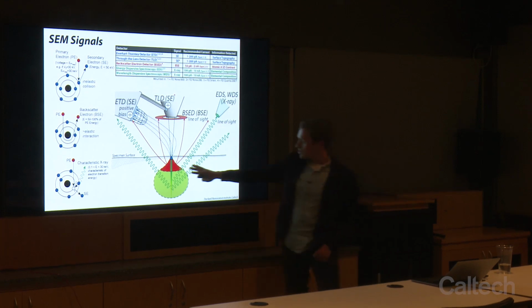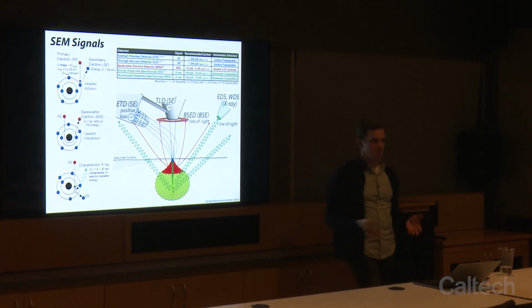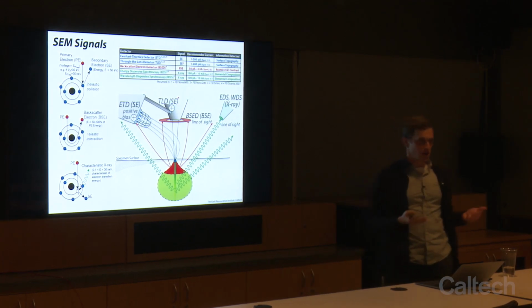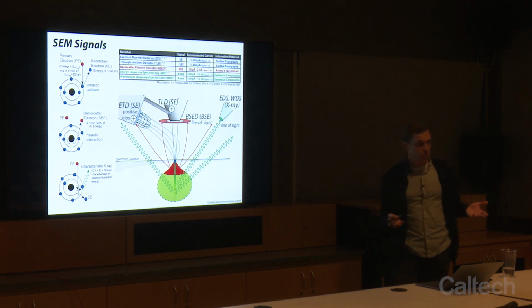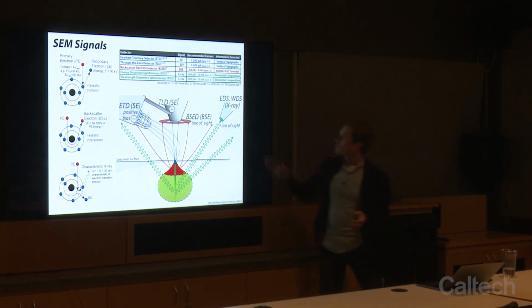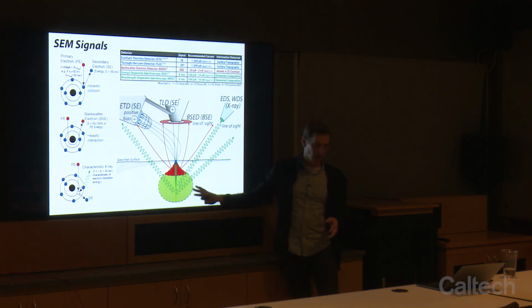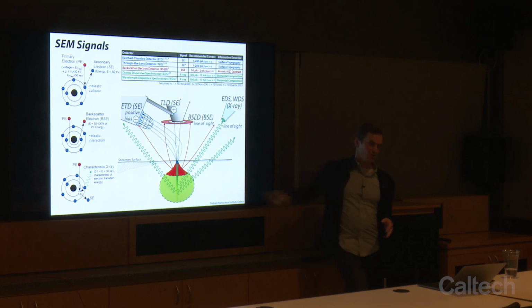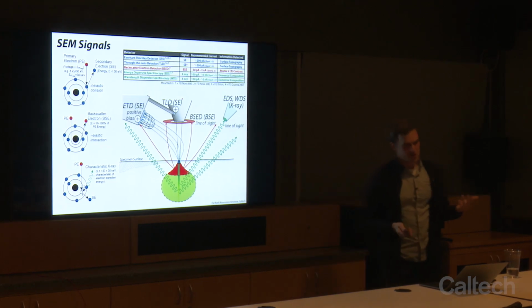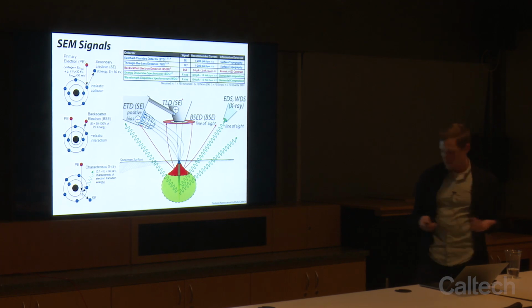which is good because you can operate at low current, which means high resolution for your topographic image. You need more current for backscattered electrons because the elastic events are more rare. So you need to really increase your current to get enough signal. And then so you won't have as good resolution in that. And then you need much more current usually for X-rays because while we do generate a lot of them, only these on this small solid angle, this line of sight to the detector, those are the only ones that we count. So you do need to be in the nanoamp range typically.